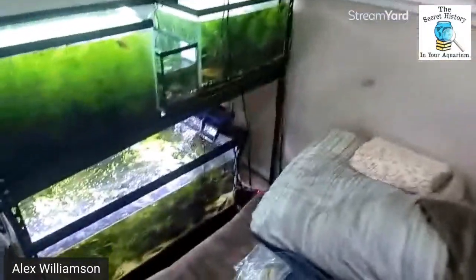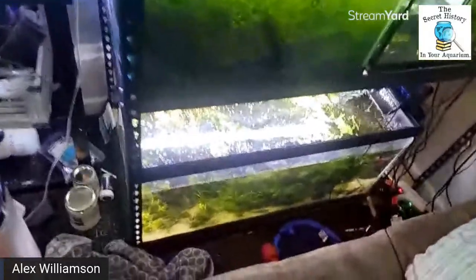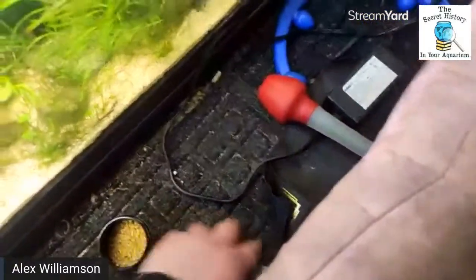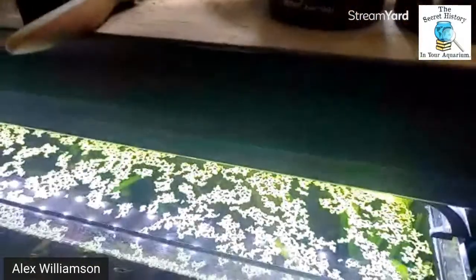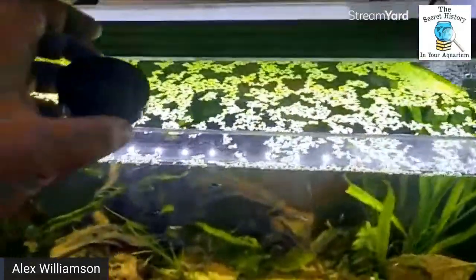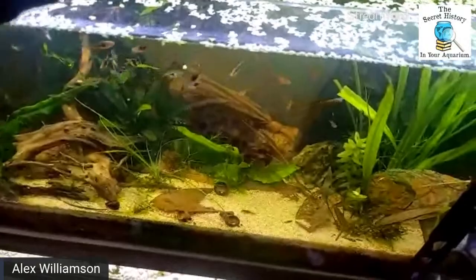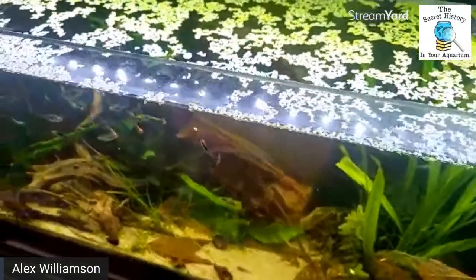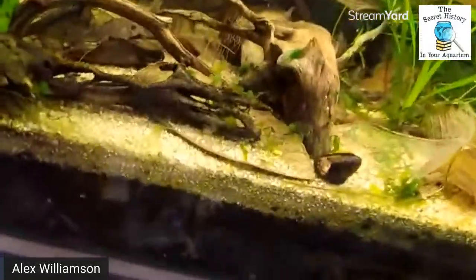Oh, it's over here. Hold on, guys. This place is a mess right now. I've been working on like five different projects back to back. All right, so the ones I dig the most are these pollen granules. And this is what bees eat. Or this is basically what they roll up and put into little containers for adult bees. The baby bees eat honey more exclusively, which is vomit of its saliva and enzymes mixed with this. But what I want to show you is how cool this would be if you had a nice HD camera to film this with.